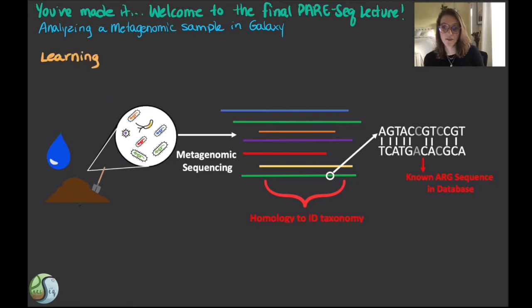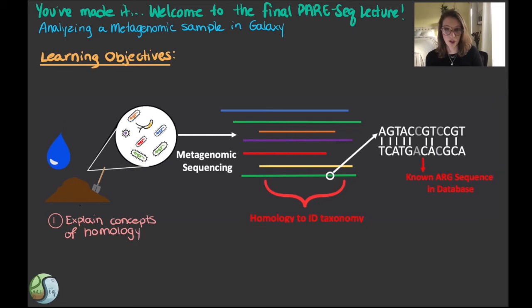You're going to leave this video with a number of different bioinformatics analysis skills. We've listed them here all in one place, but throughout this video, we'll make sure to tie each concept back to one of these 5 learning objectives. By the end of this activity, students will be able to: 1, explain why the concepts of evolutionary conservation and homology underlie bioinformatics research.